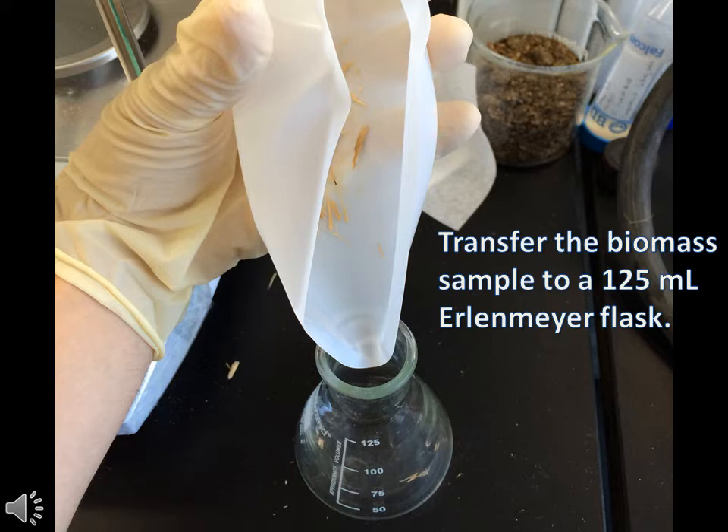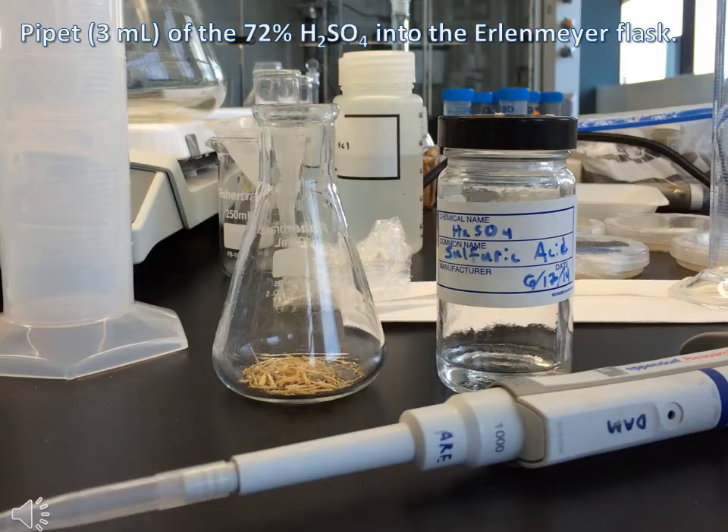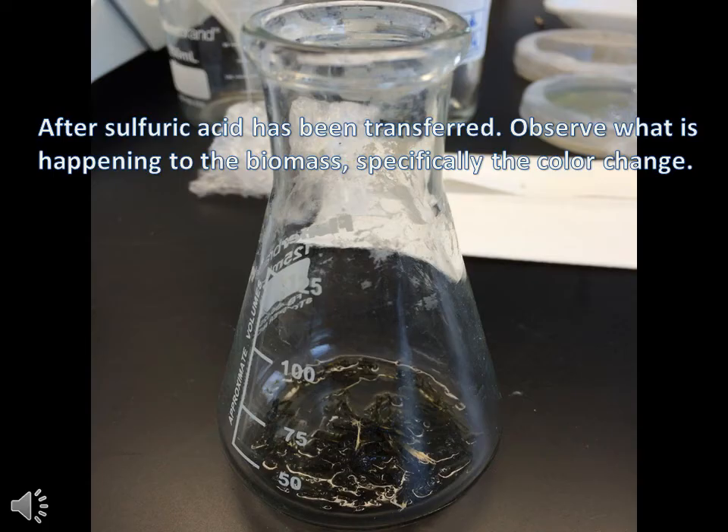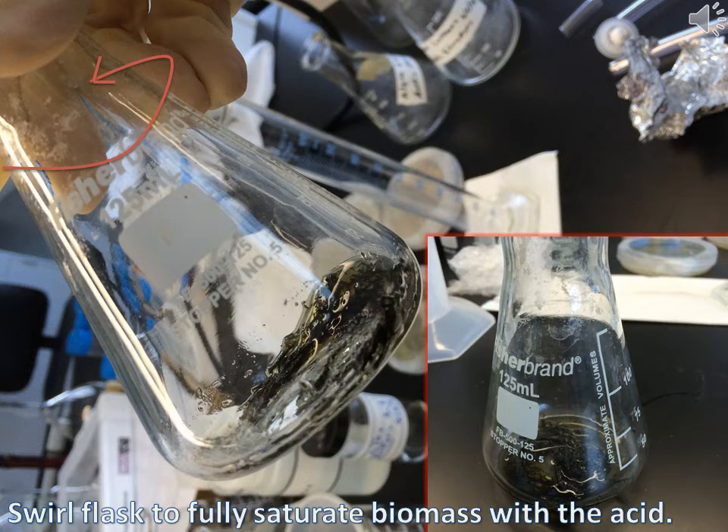Transfer the biomass from the weigh boat to a 125ml Erlenmeyer flask. Pipet 3ml of the 72% sulfuric acid into the flask. Make sure you observe what is happening to the biomass when you add the acid to the flask. Swirl the flask around to fully saturate the biomass with the acid.